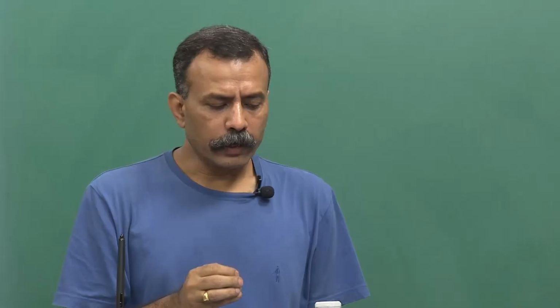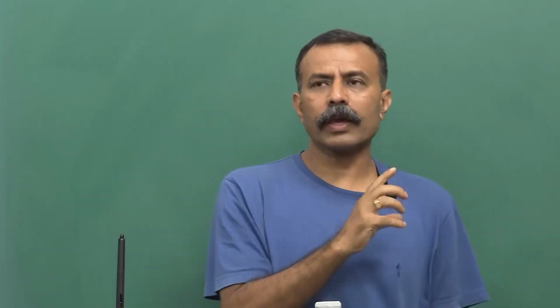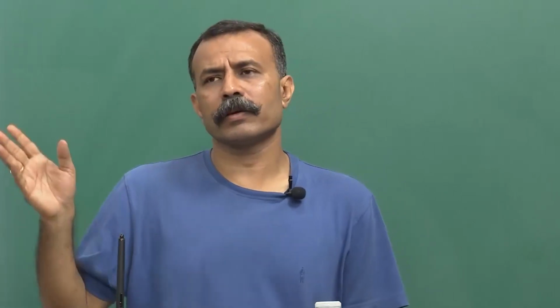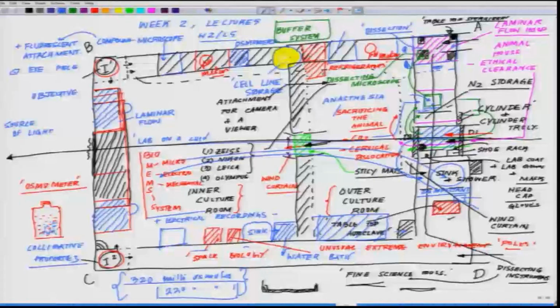So you see, as of now we have discussed some of the specific areas. This area may go a long way. I have only talked to you about, say, suppose you have a facility for working on space systems, space biology, or you are creating a system of extreme environment, so you have to have separate incubators, or you are working on something like microelectromechanical systems and electrical recordings.